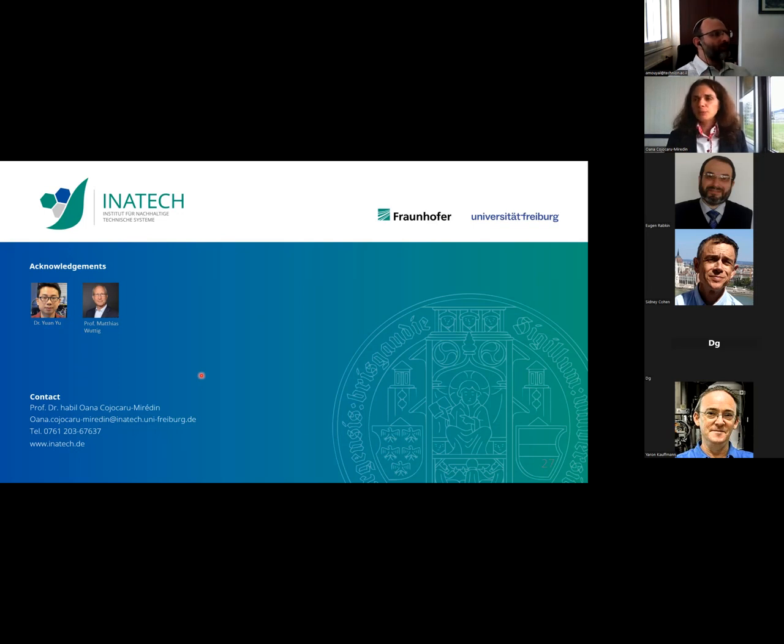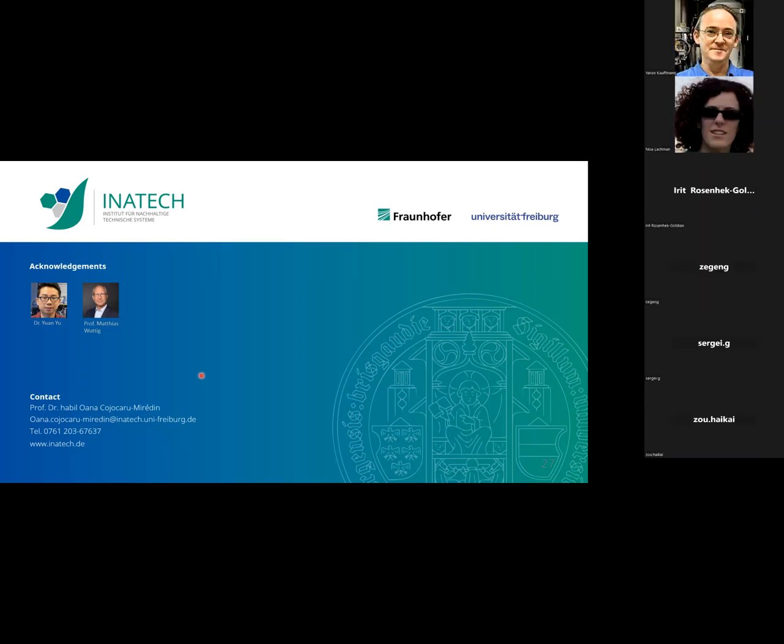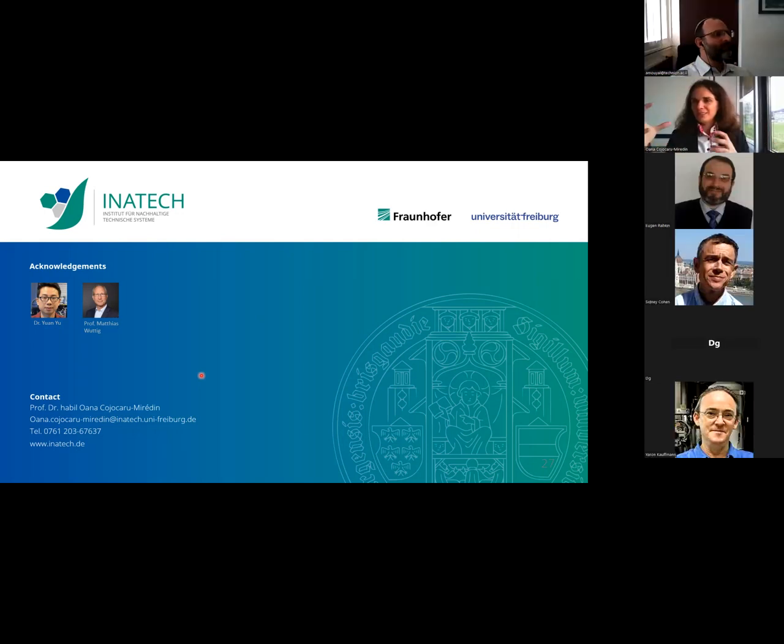Of course, correlative microscopy also needs complementary expertise and complementary techniques, and it opens the possibility to create collaborations, because you might be an expert of the atom probe, but not necessarily an expert of the whole setup like I showed here. Here we had three expertises to reach one study, but in the end it's very rewarding. I think this also offers the possibility to put people together to work on a joint project, which opens new science, and it's also very rewarding for the group.